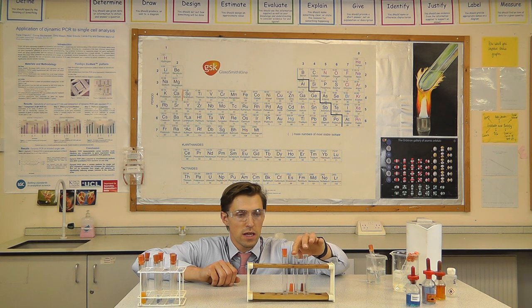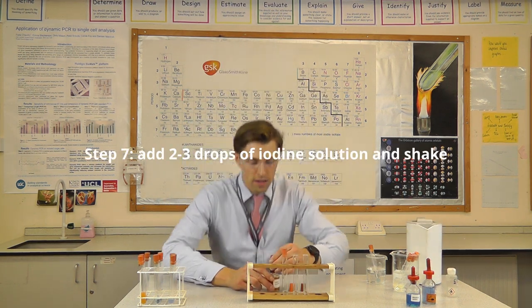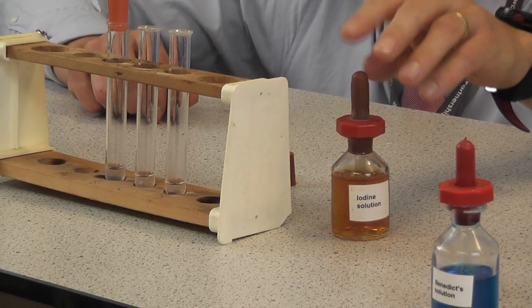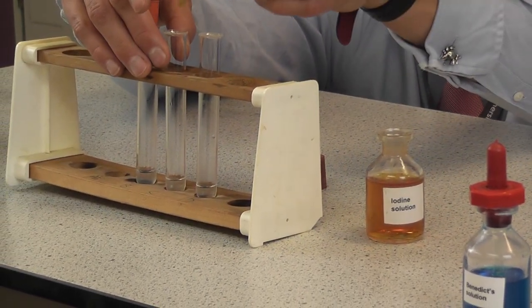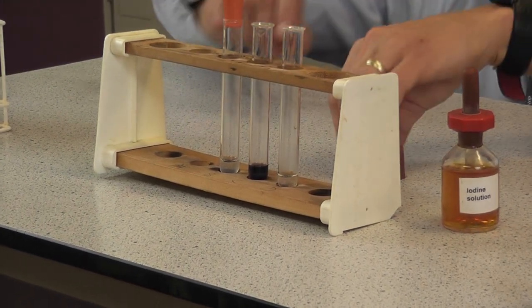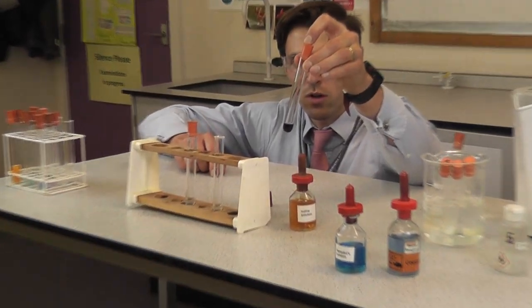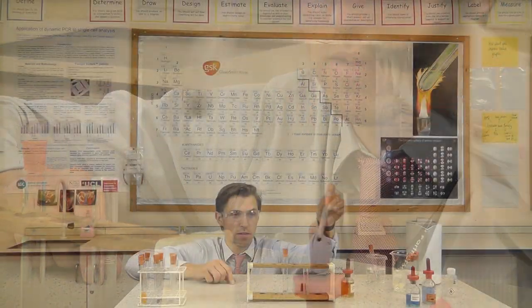The next test is for starch, using iodine. Iodine starts off as a nice dark yellow-orange colour. If there is starch present we should see a blue-black colour, and this should be evident very quickly. I've added just three or four drops — it was clear from the first drop, I don't even need to shake it. We've got a very dark blue-black, almost black. So it's definitely got starch in the biscuit.